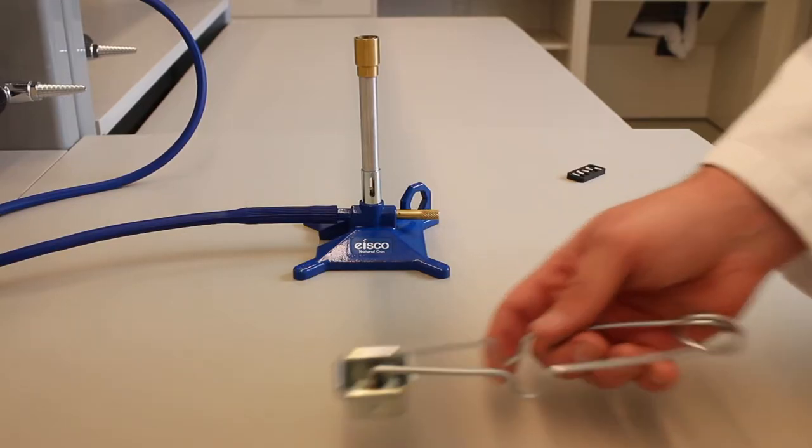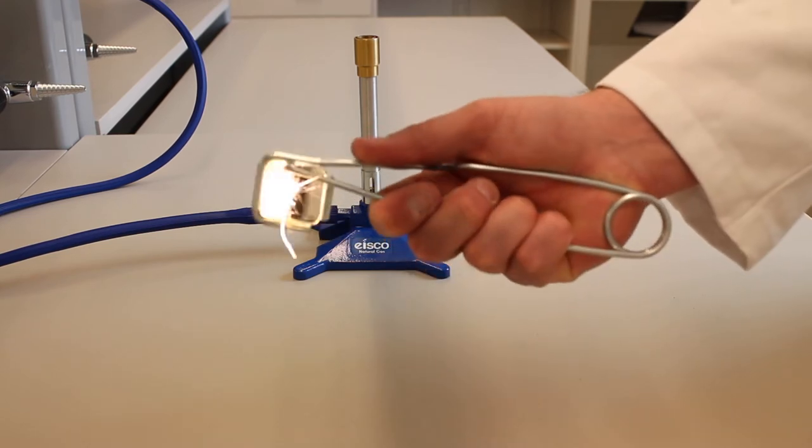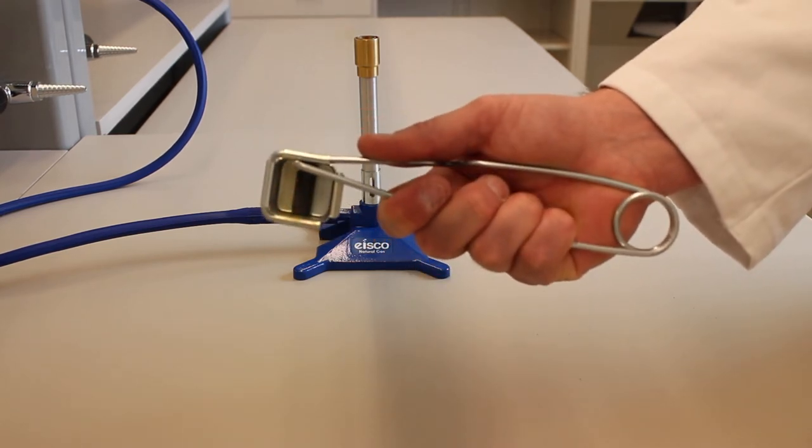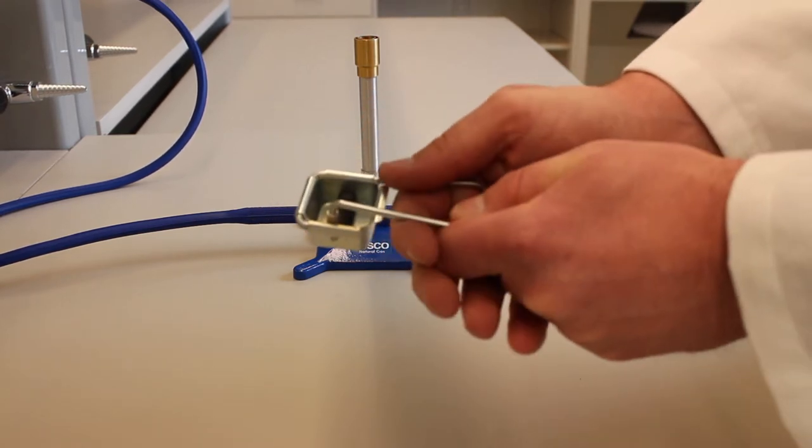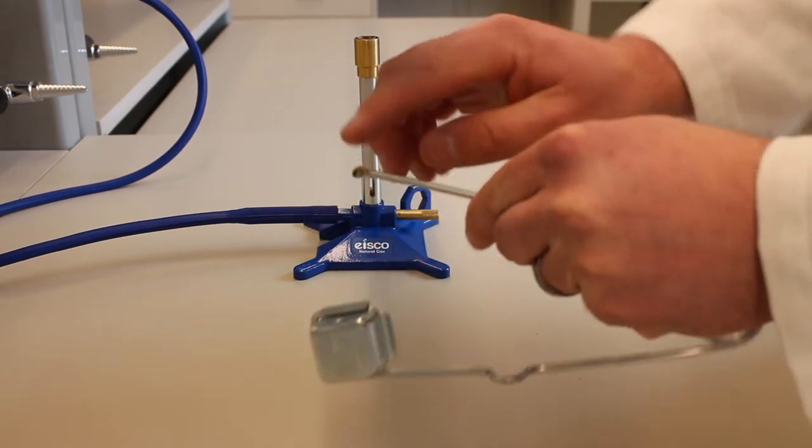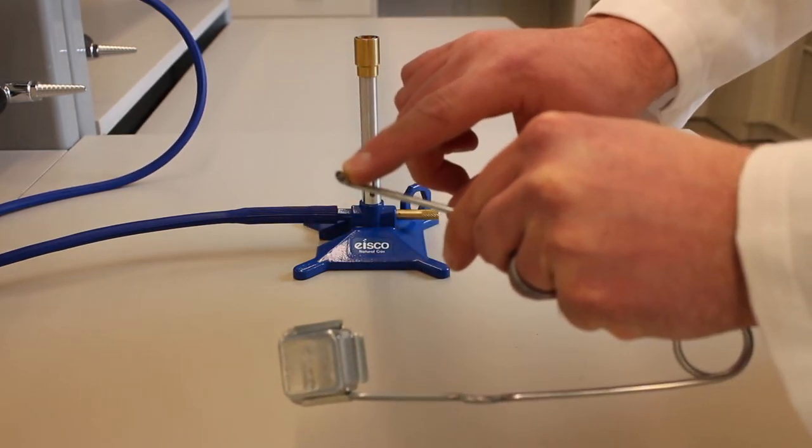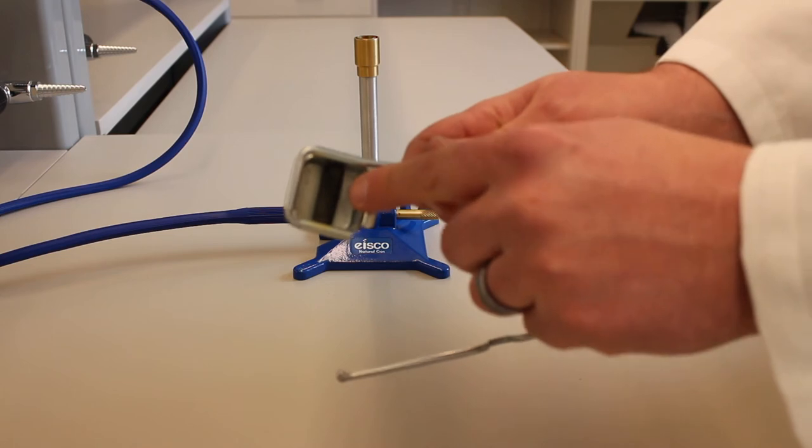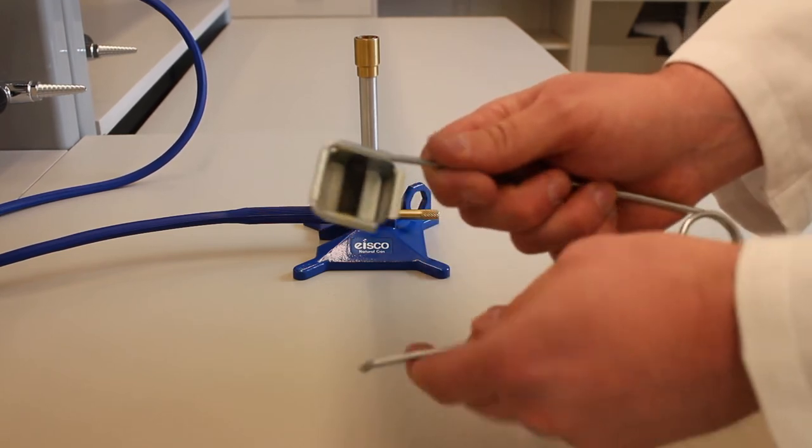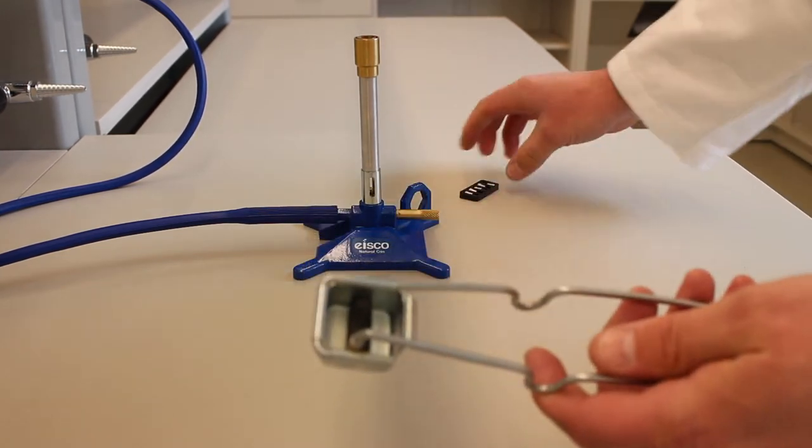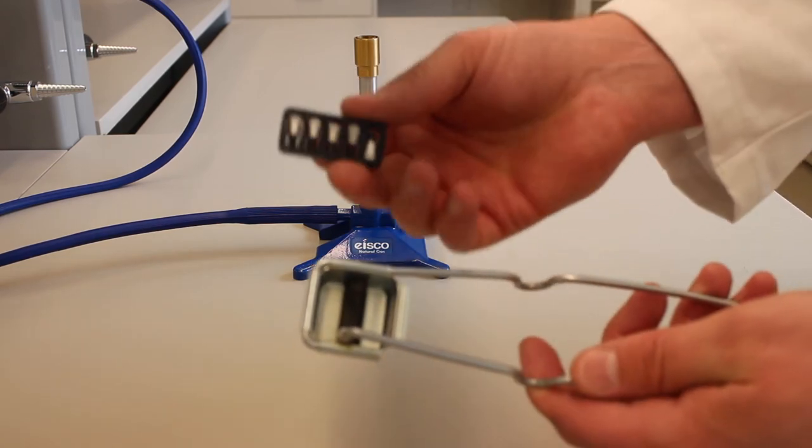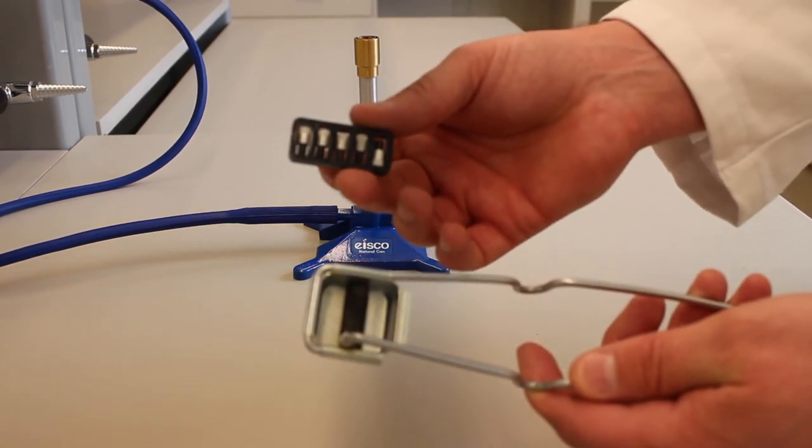To start a Bunsen burner, you'll need a striker. The striker will produce a spark that will ignite the gas coming from the burner. It consists of a tiny piece of flint which is rubbed across the rough metal surface inside the striker. If you ever see that this flint is worn down and is no longer visible, let your TA or instructor know so it can be replaced.